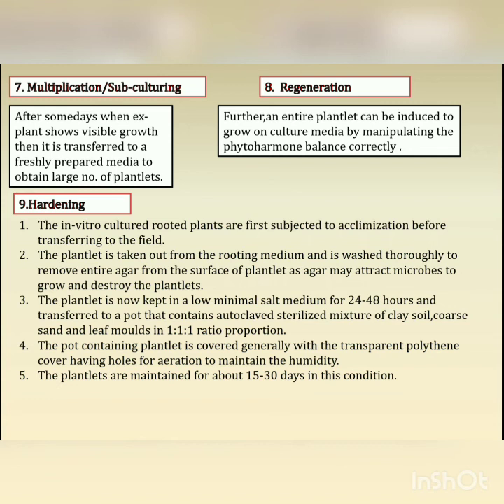Now, what is this agar? Okay, tell me in the comment section, from where do we get this agar? So agar is a solidifying agent. The media in which we inoculate our plantlets contains agar, which is used to solidify the media.